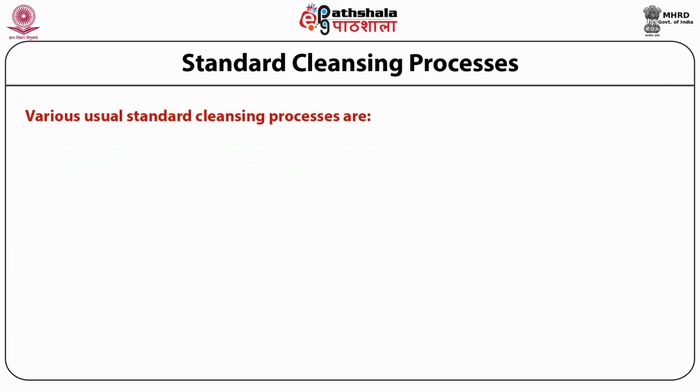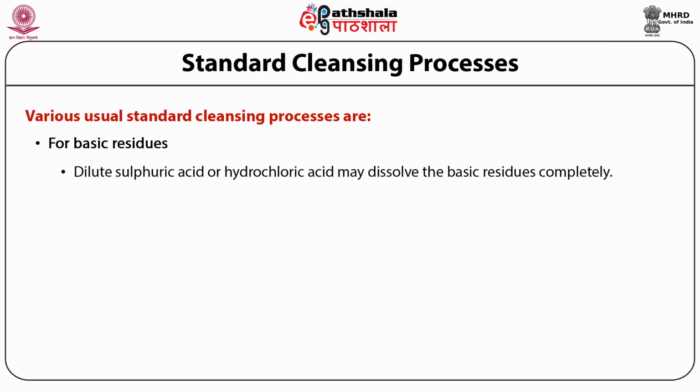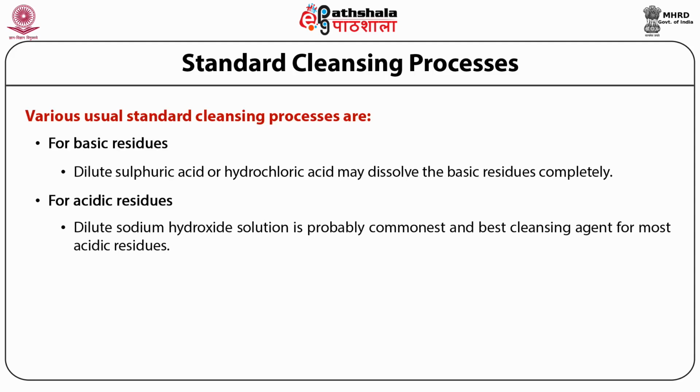The various usual standard cleansing processes are: number one, basic residues. Dilute sulfuric acid or hydrochloric acid may dissolve the basic residues completely. Number two, for acidic residues, dilute sodium hydroxide solution is probably the commonest and the best cleansing agent for most acidic residues.